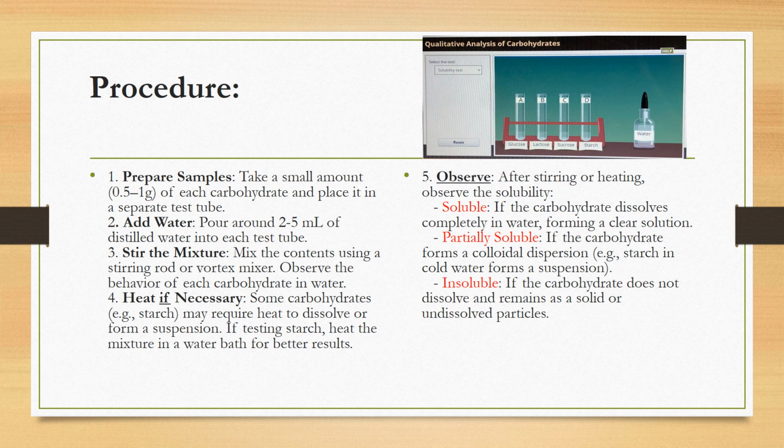Okay, the observation. Observe after stirring or heating. Observe the solubility. We say the sample is soluble if the carbohydrate dissolves completely in water, forming a clear solution.